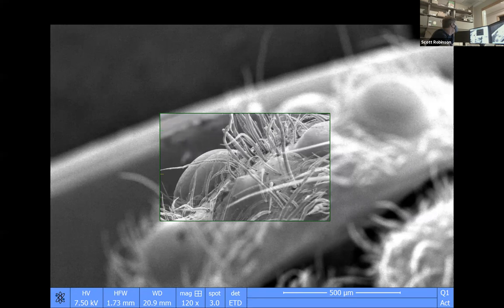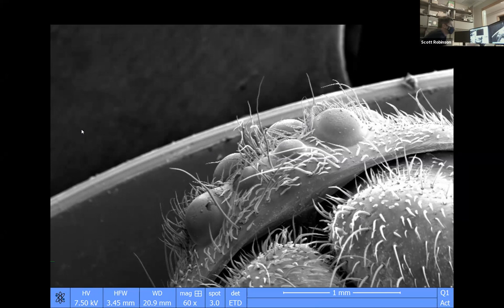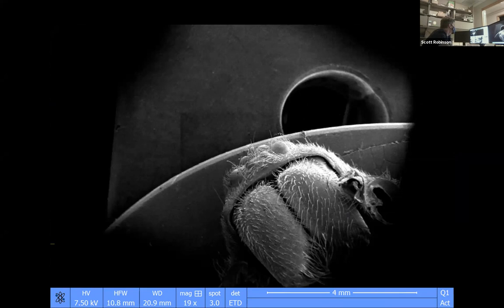Some spiders have urticating hairs, and for example, tarantulas do, and tarantulas can fire their hairs at you, and urticating means itching, and some tarantulas can fire those hairs in, and they'll stick into your eyes, for example, really, really fine hair. So you have to be really nice when you handle your tarantula. Yeah, I think that's a feature that's unique to tarantulas. I think one of the diagnostic factors is that they have these irritating hairs.